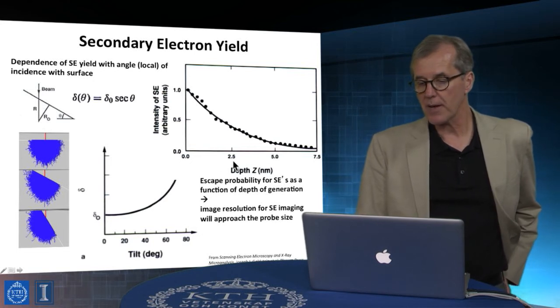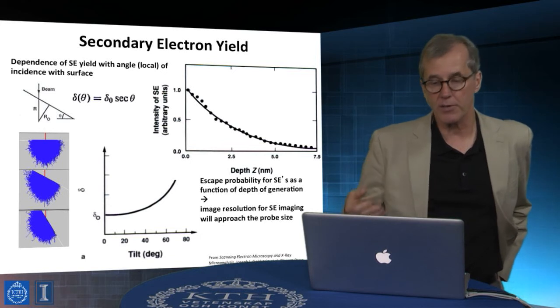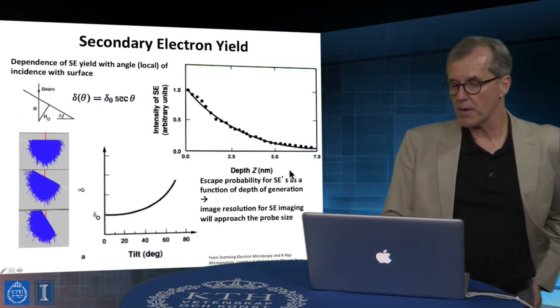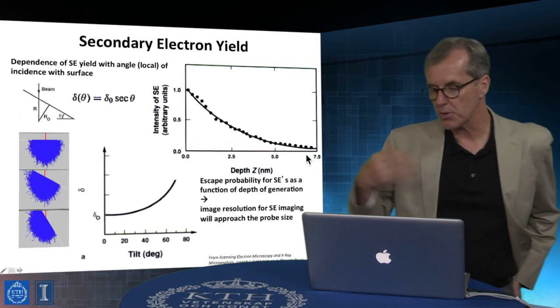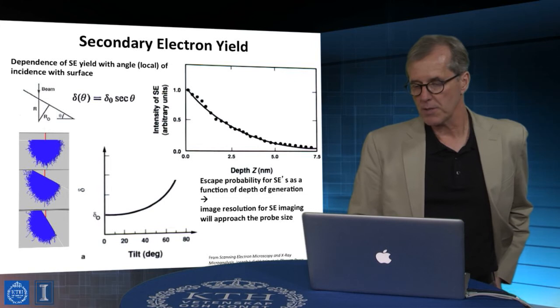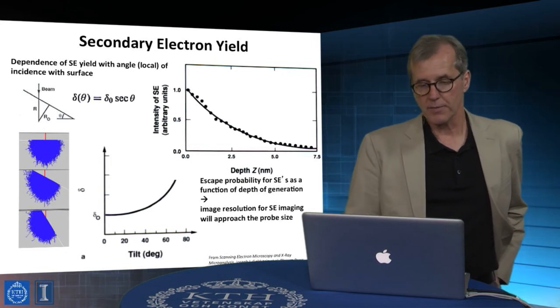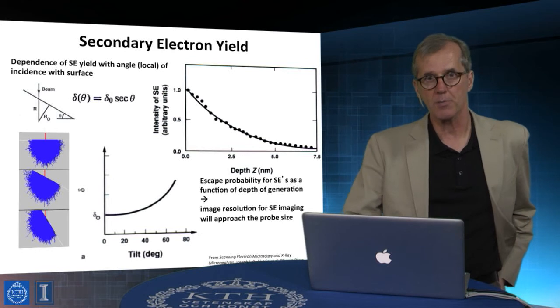But it also has the effect that it scales the spatial depth sensitivity that you're collecting electrons from. So typically the skin depths for these electrons are going to be of the order of nanometers to tens of nanometers. So you can see we're looking at the materials to hundreds of angstroms potentially, and varying that via the agency of this solid angle just by a sample tilt as the mechanism for controlling that.